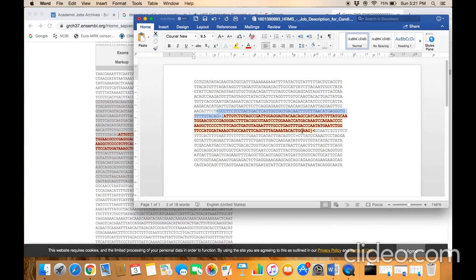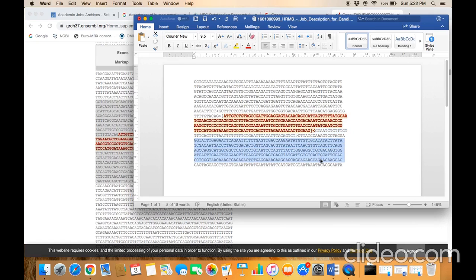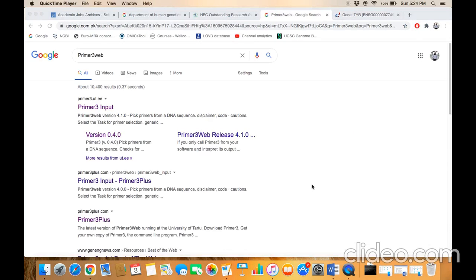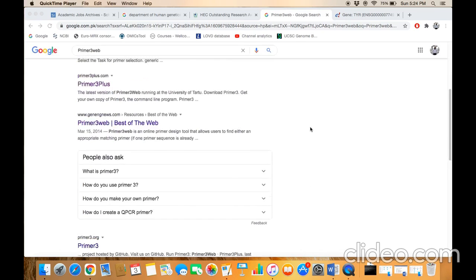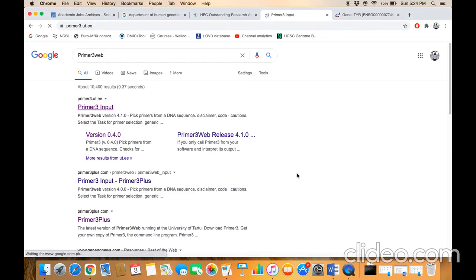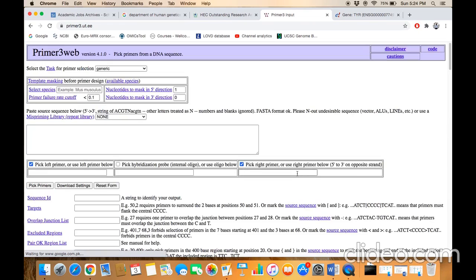commanded not to design the primer - the software is commanded to design the primer outside this excluded region. Then copy all the sequence, type 'Primer3 web,' and you'll come to this result page. Click on the first option, Primer3 input. This is the home page of the Primer3 web online tool for designing primers. Once again, you have to set some parameters.